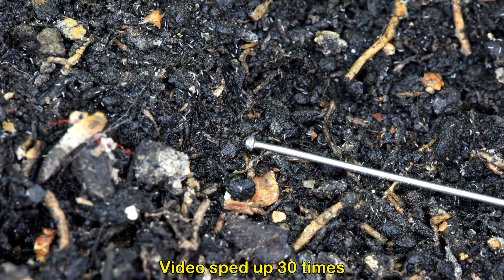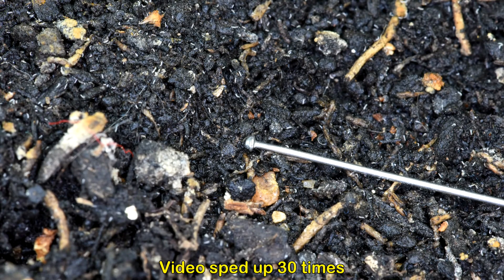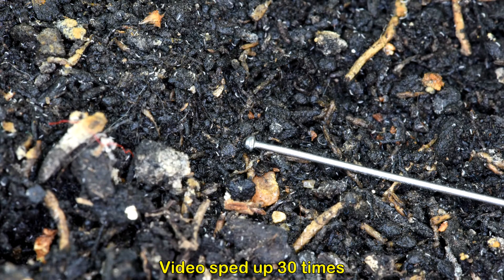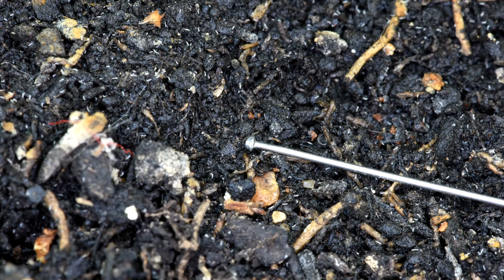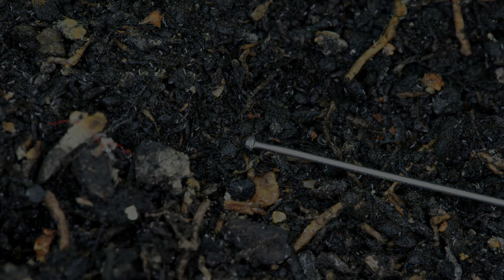No wonder I didn't notice them at first — they're only about half as long as that pin is wide. You may be interested to know that the 20-second clip you just watched actually covered a period of 10 minutes.